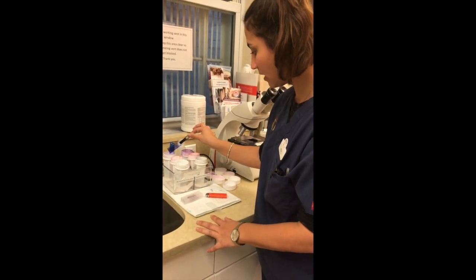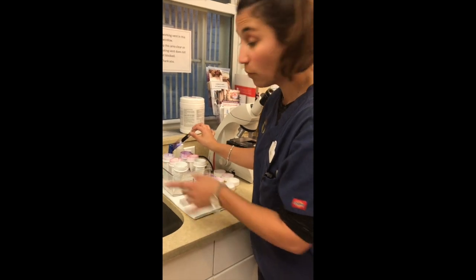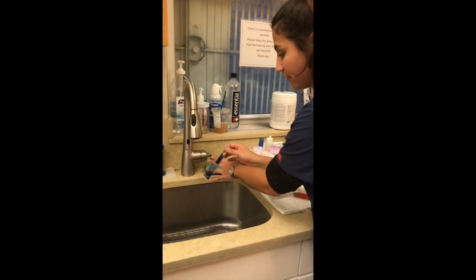Let the excess drip off, and now I'm just going to gently wash it off, just to get the excess stain off.